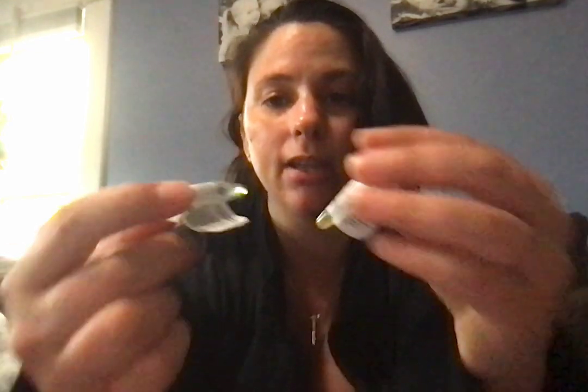And then I had maltose. And this looks clear, but if I kind of mess with it a little bit, you can see the precipitate go towards the top right there, which, looking at it now after it's been a couple of days, it looks like maybe there's more in the lactose than in the maltose. So that's going to be off a little bit on my lab report.